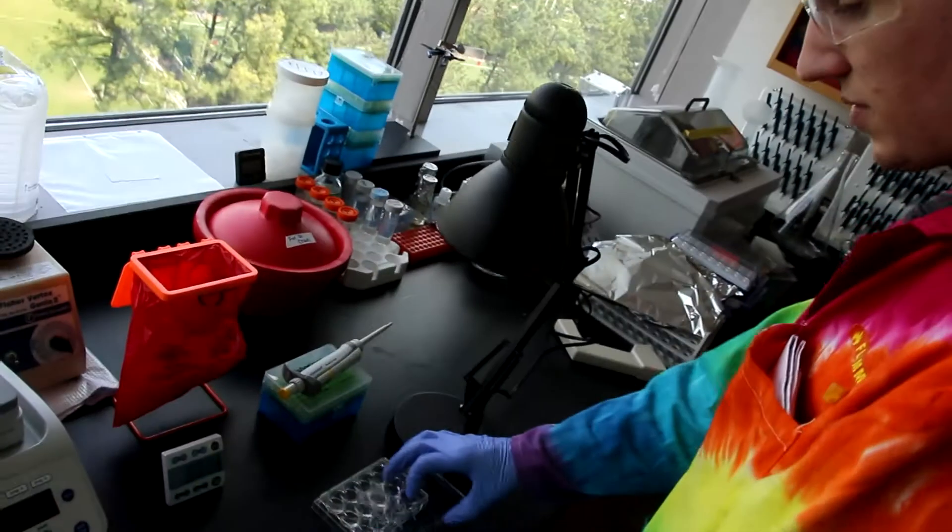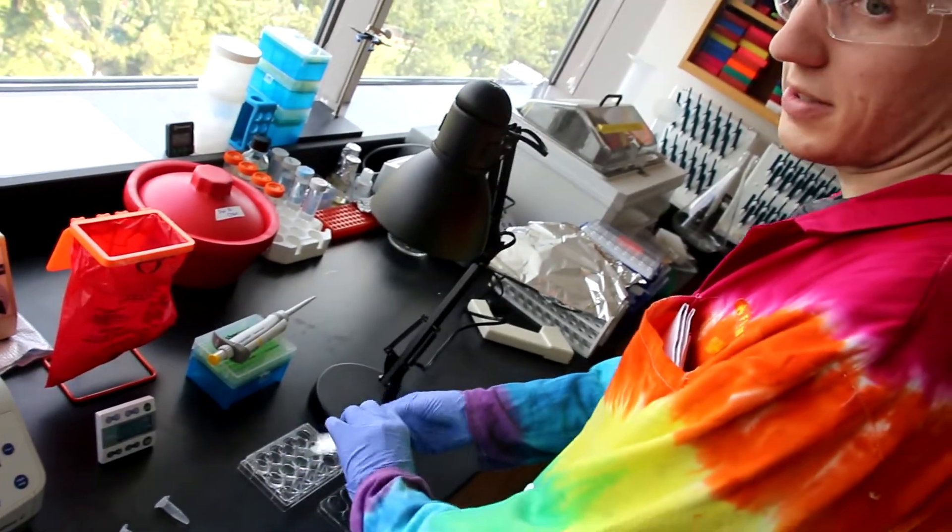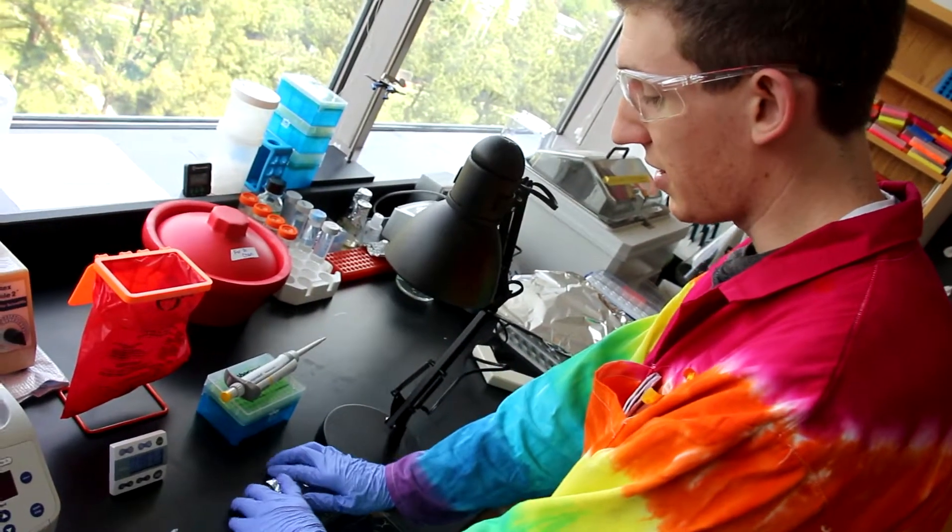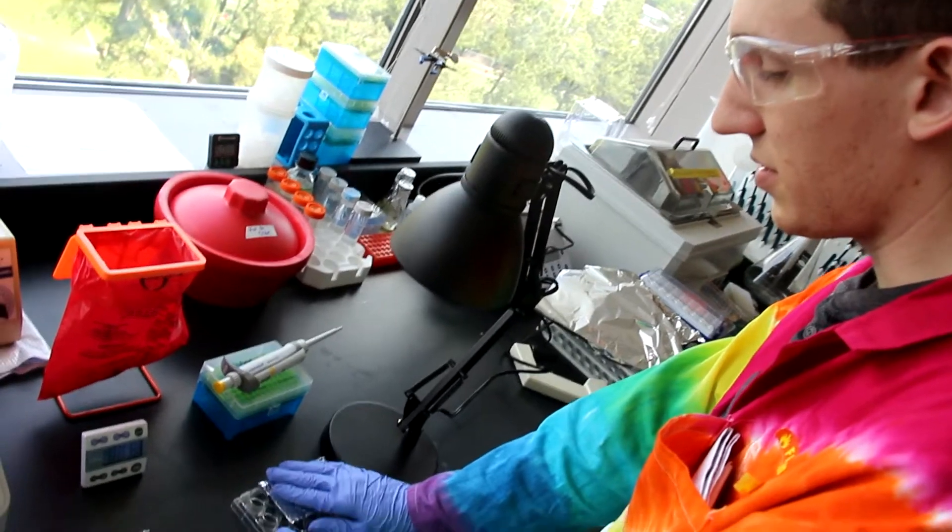First, you'll want to remove the lid of the plate and foil off all wells other than the untransfected control and the positive control.